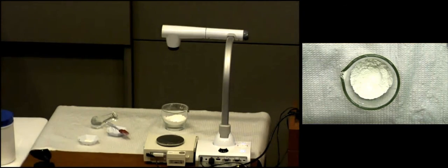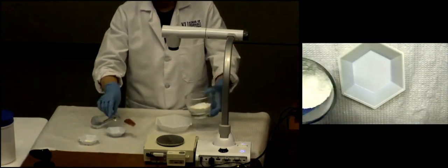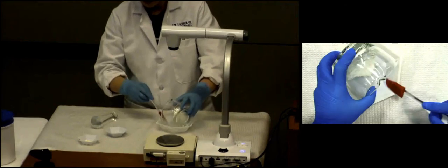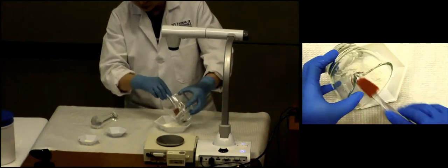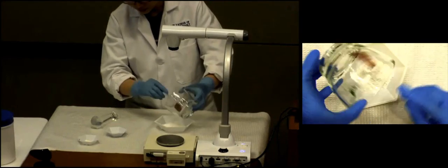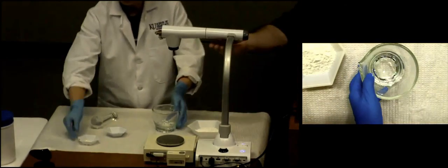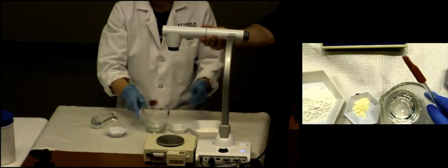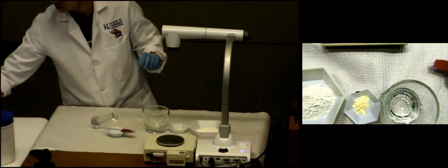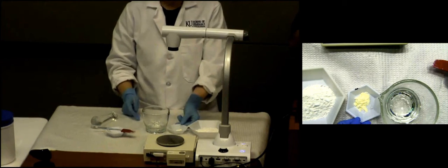Now, can we just geometrically add the nystatin at this point? No, that's not going to work. So what we've done, though, since we've made a nice homogeneous blend with our powders, we will transfer that into a weigh boat. Transfer all the absorbent powder into a weigh boat. We need to wash it out. Well, we don't want any water in there, but we'll scoop it as much as we can. That is set aside. Nystatin next to it. And that's why, I mean, you can just tell there's no way to make sure that the nystatin gets completely mixed in if you try to mix both of those groups together at one time. There's just way too much of the bulk powder.